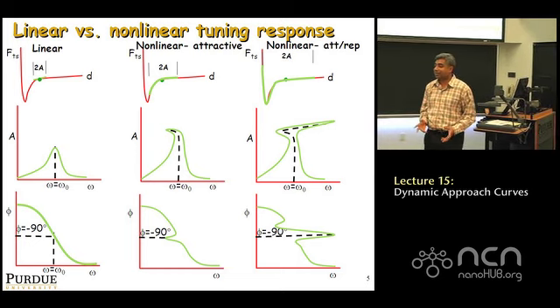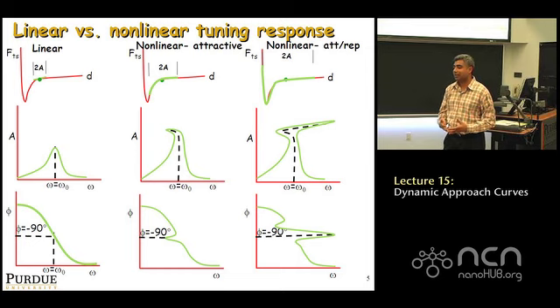So that certainly suggests that you have the possibility of multiple oscillation states going on. And so as soon as you have multiple oscillation states going on, you have to start worrying on AFM about, oh my goodness, if my oscillation state changes, my image may change. And so certainly the first thing that should come to mind is, if oscillation states are different, why are they different?